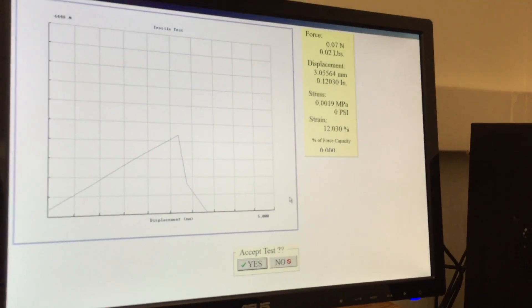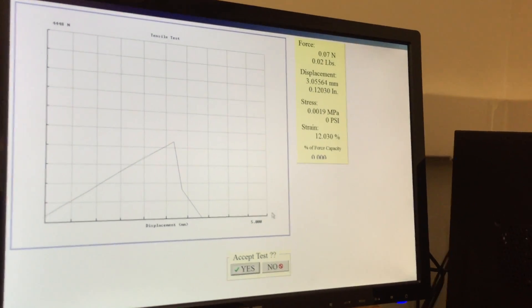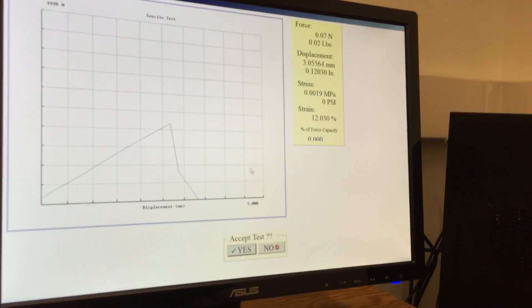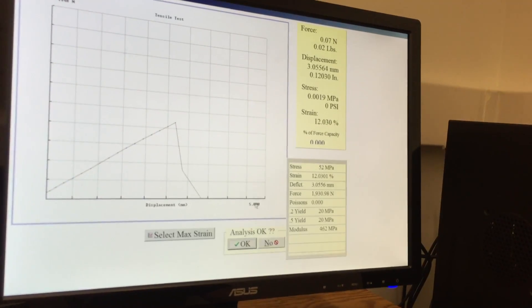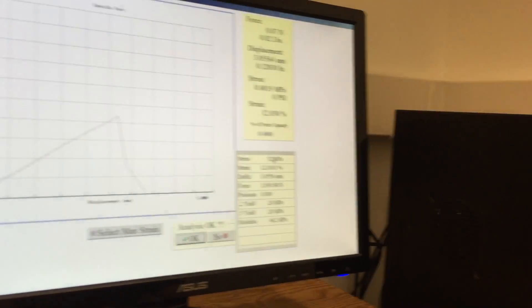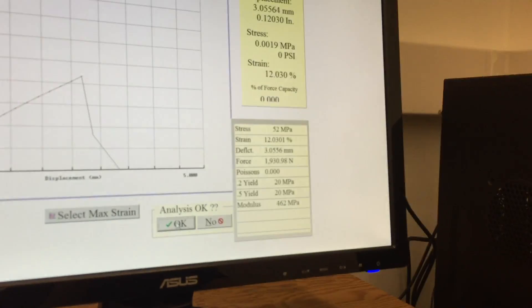As you can hear, it unloads the specimen. If the results look okay, hit accept. Numbers look reasonable, hit okay.